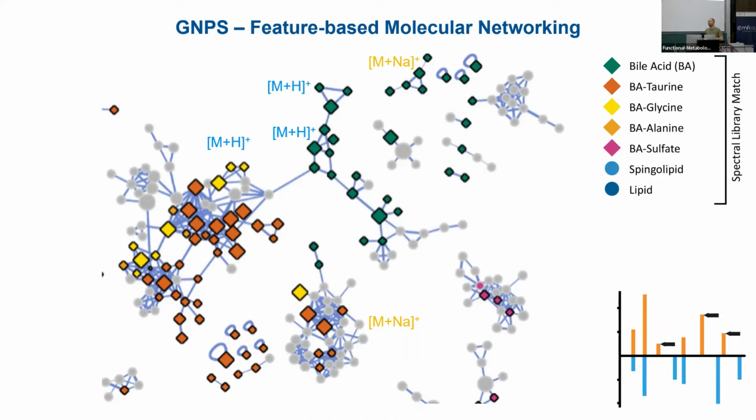We can say that most of the time, the modified cosine similarity is more geared towards single modifications. And then of course, traversing the graph, we might have a single modification and again a modification on a different side. And then you come to multiple modifications over the graph. But other metrics might be better, for example, for very complex multiple modifications.